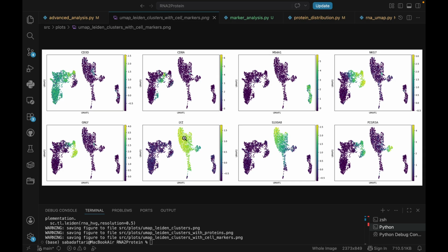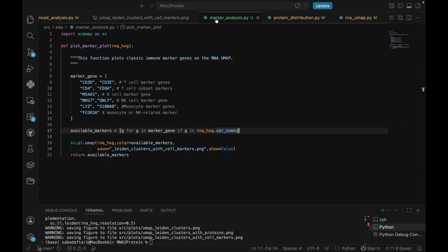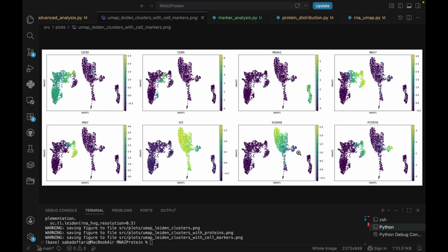And so based on our definition here, yeah, both of them belong to the same marker gene. So that's good. And then which else is similar?